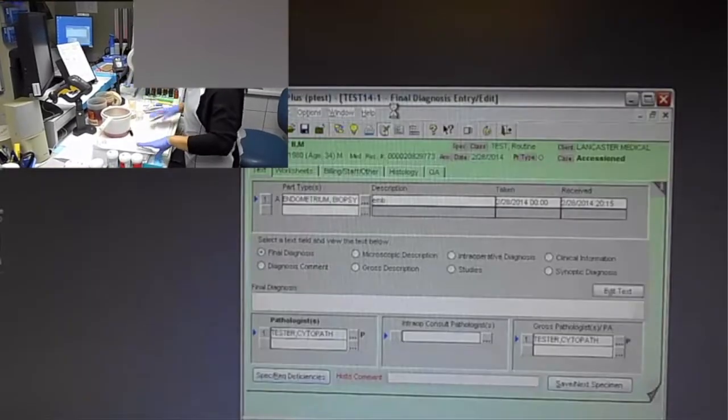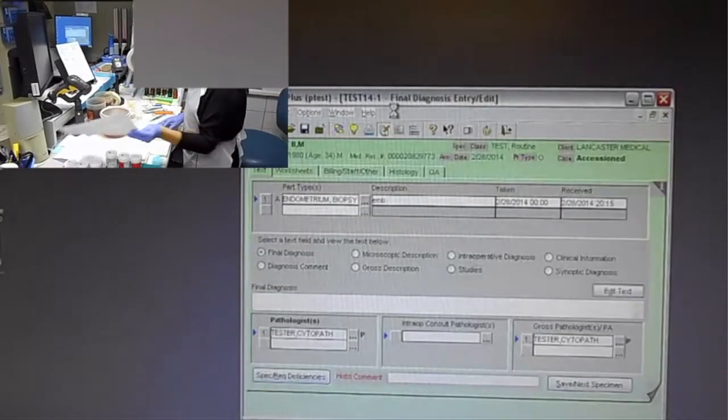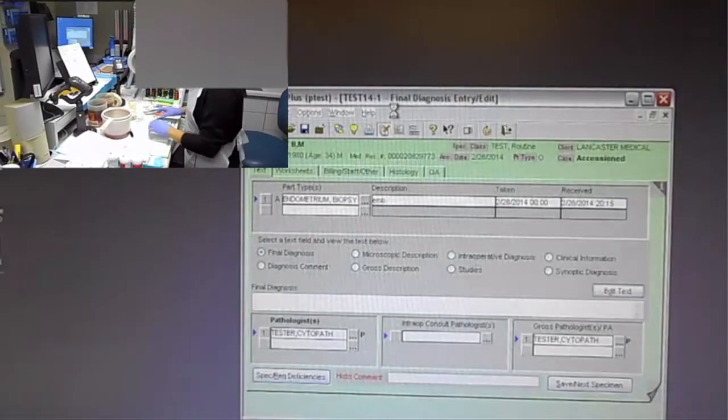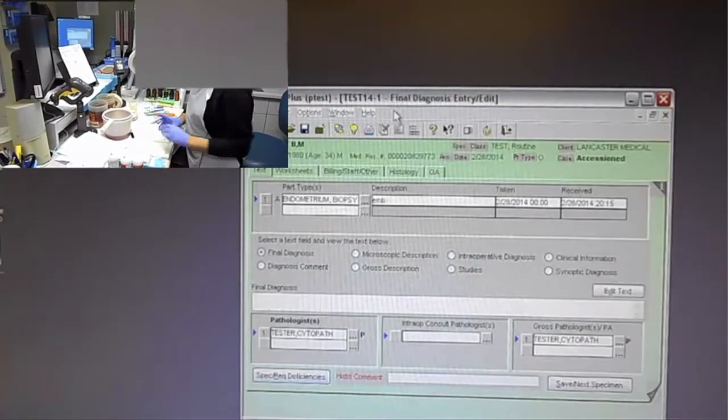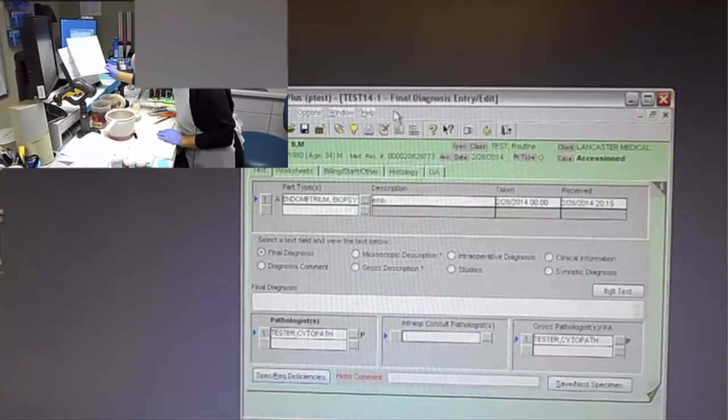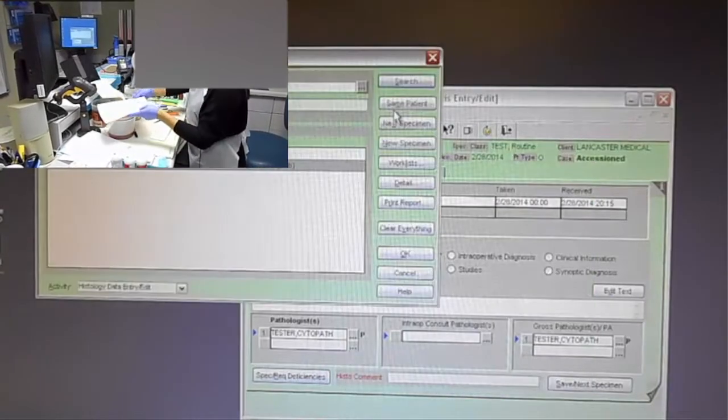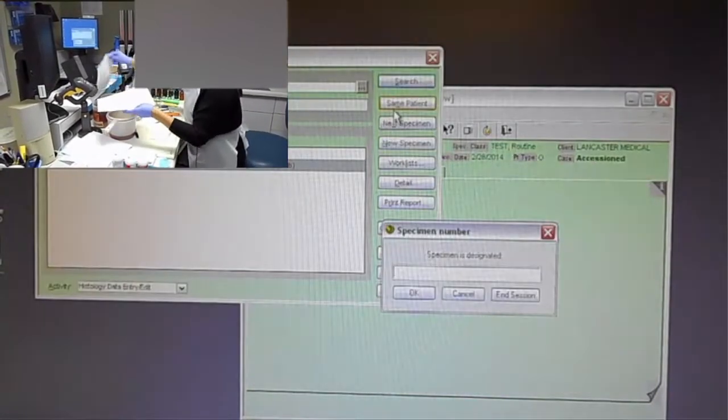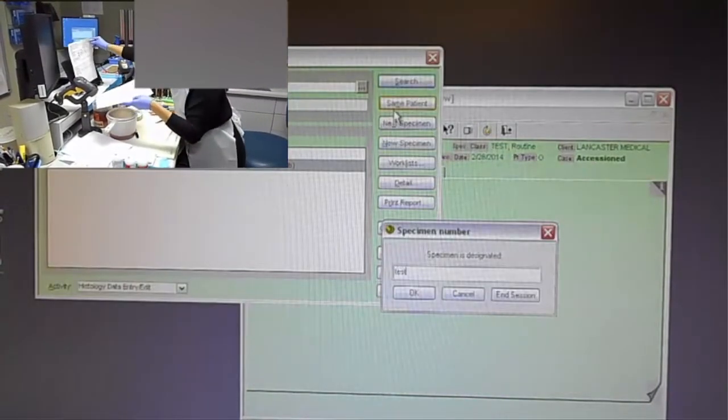So moving along here, she's going to scan on the right scanner, put it into transit status, and then it's the next specimen. She's going to move into the next specimen.